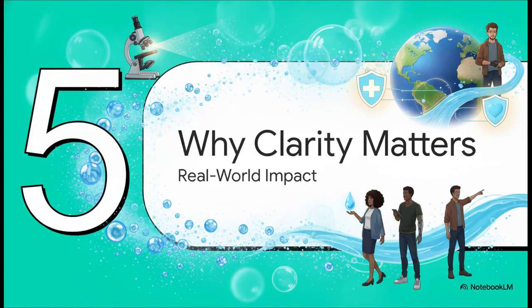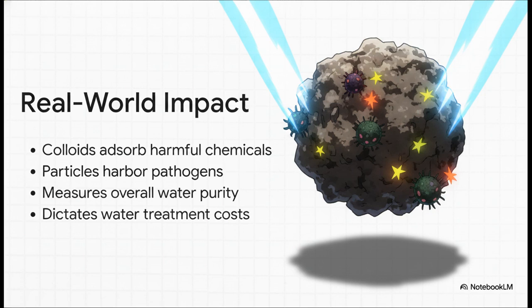Finally, Section 5, why water clarity matters. So why do we actually care so much about a reading of 0.1 versus 0.5 NTU? Well, beyond just making sure our drinking water doesn't look dirty, maintaining extremely low turbidity is absolutely crucial because of what those particles can hide.